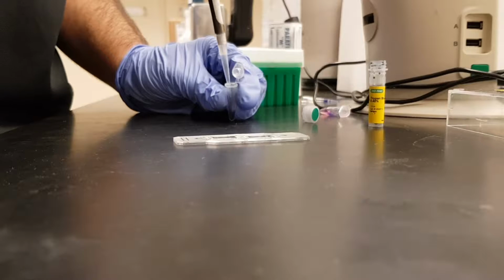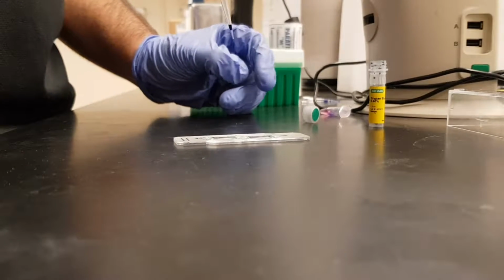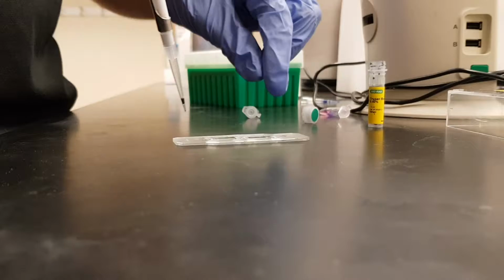Pipette 10 microliters of the cell suspension into the opening of either of the two chambers of the counting slide and measure using the electronic cell counter.